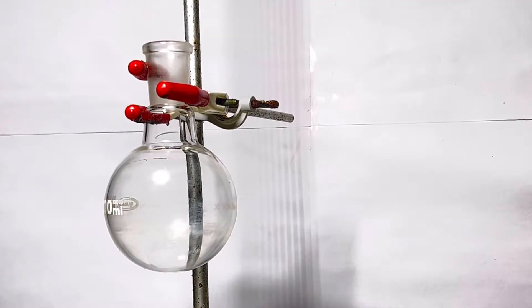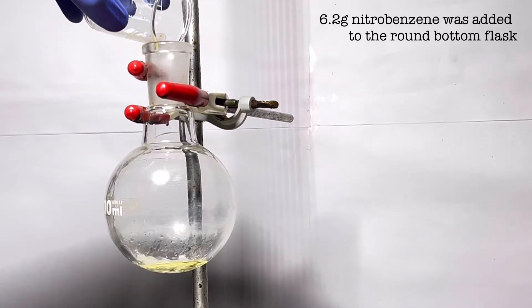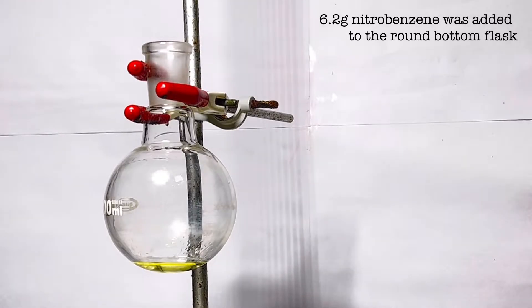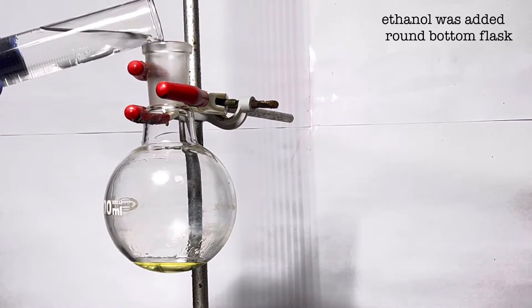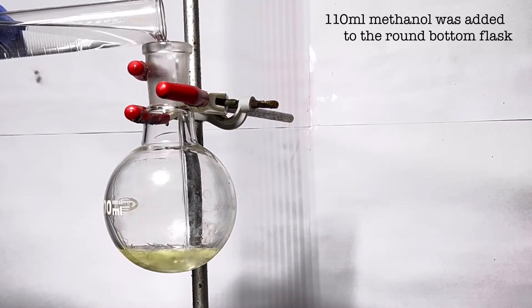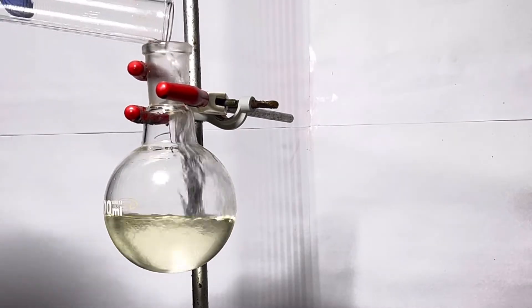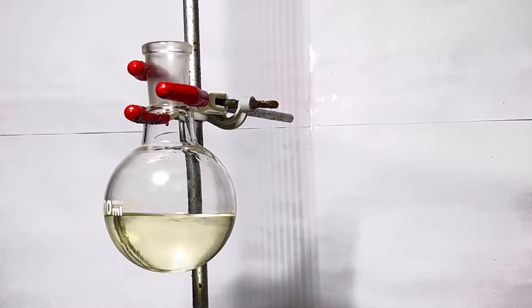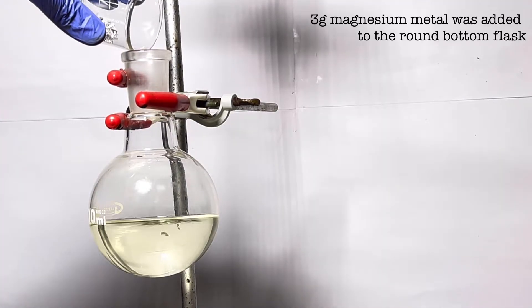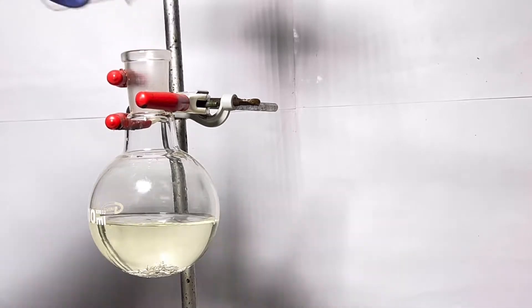Start by fixing a 300 ml round bottom flask on a stand using a clamp. Add 6.2 grams of nitrobenzene to the flask. 110 ml of methanol was measured in a graduated cylinder and was transferred to the flask. 3 grams of magnesium metal turnings were then added to the round bottom flask.